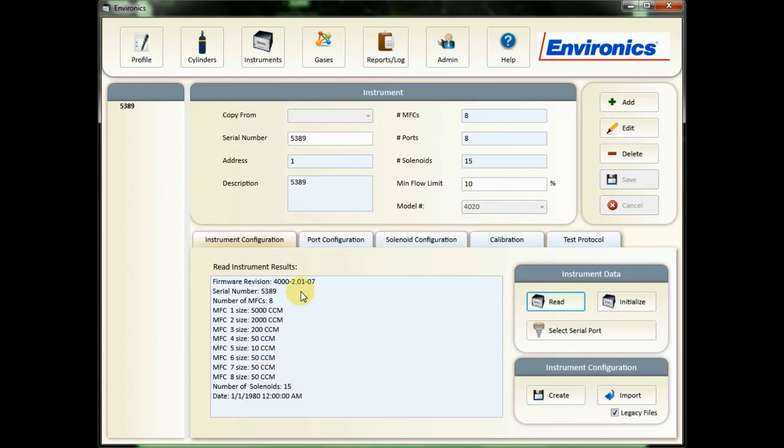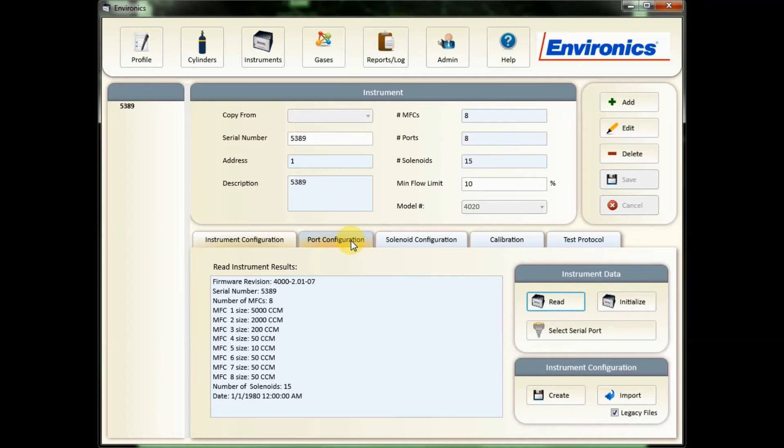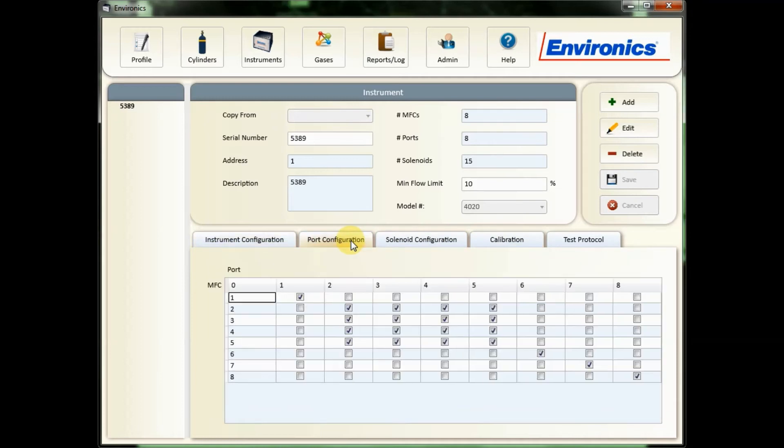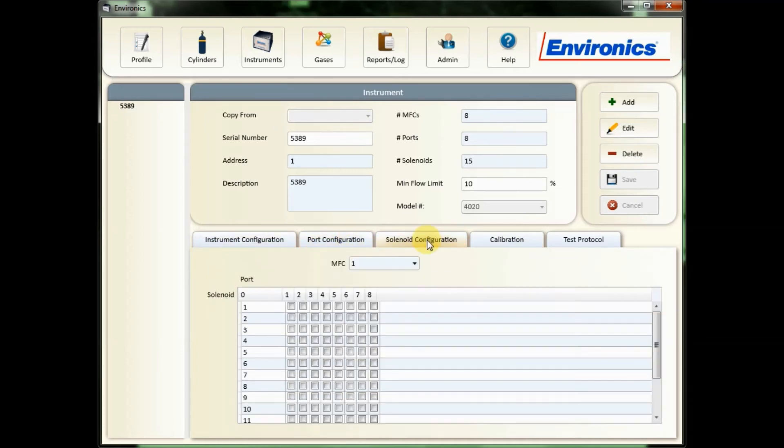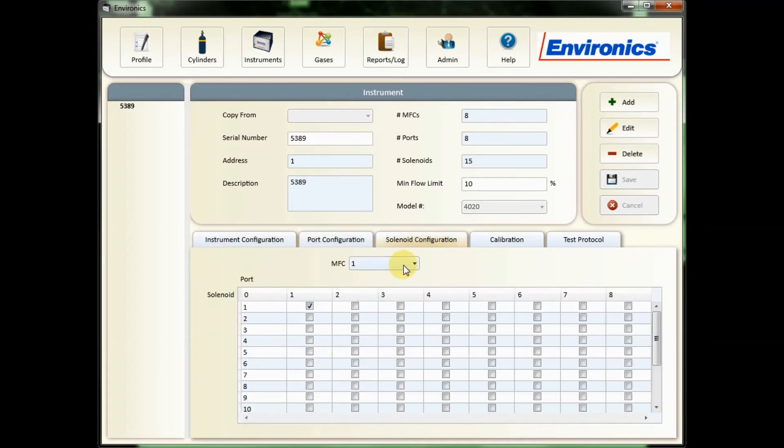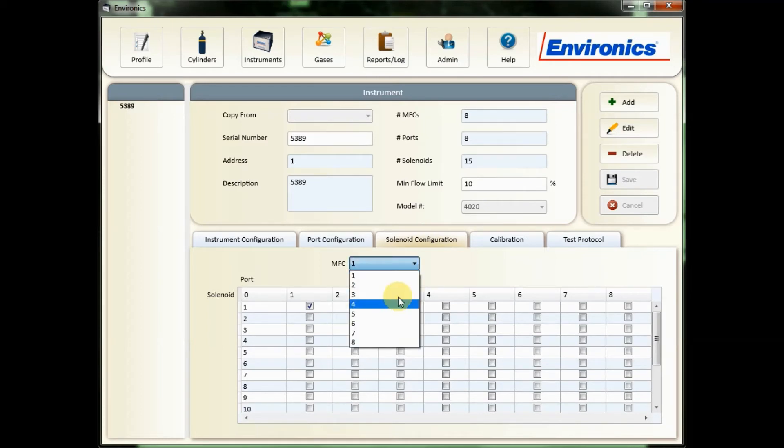You can then verify that your instrument data has properly imported into the software by clicking on these other tabs, which will show you the port configuration of the unit, solenoid configuration of the unit by MFC using the drop-down here, and also the calibration data.